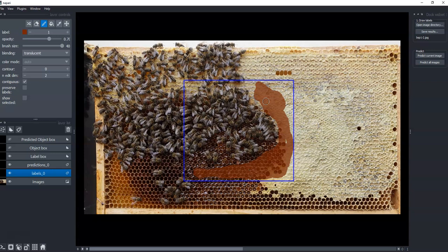0 is still background, and integer indexes are objects. So what I'm doing here is I'm going to label background as 1, then label the objects with higher indexes, but then when I eventually try to make patches out of this, I'm going to subtract 1 from it. So then this background here, which is 1, becomes 0. The unlabeled stuff will become -1, and the label image will be ready for the sparse training algorithm.